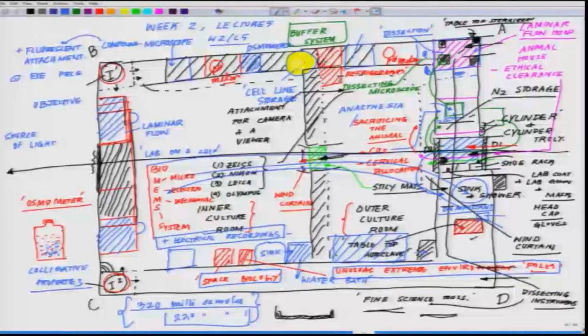So you may love to have all these facilities in and around you, and these are helpful for that. We'll be coming later to the microfluidic setup. There are people who are working on microfluidics, there are people who work on reactor designs or microreactors. Okay, and there are those who are working on gas exchange assemblies.